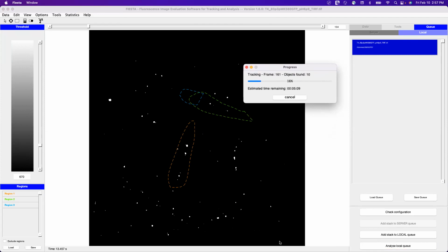If we look into this software in a bigger way, it's like we feed in the point spread function of the dots, and then we have a lot of dots in the first frame and a lot of dots in the second frame.